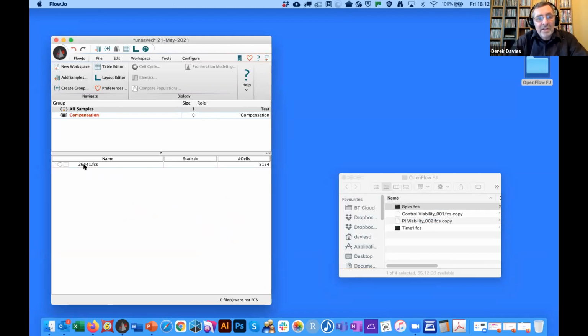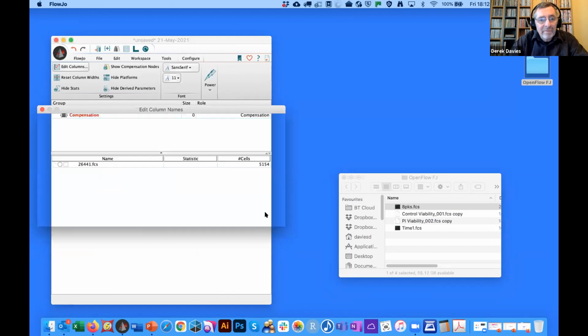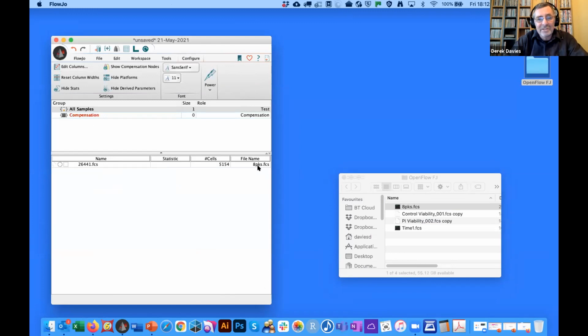You'll notice here that this doesn't say 8 peaks. I'm going to just add the file name in here. Don't worry about what I'm doing here, but this gives me the actual name of the file because this is a Diva-based file. It wasn't exported correctly and it's been given the Diva name there. So I've got one file in here and you'll notice it says .fcs.